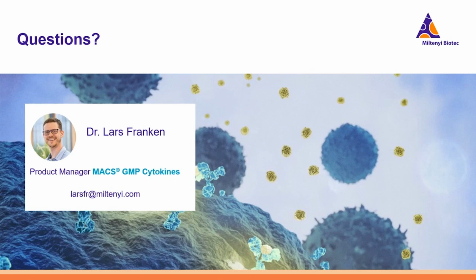Okay, so for that, two things would be really important. If you spend your time on side-by-side testing, first of all, you need to know roughly where you start. You remember this dose response curve: you have a lower plateau where not much is going on, and then a top plateau where, rather independent of the concentration you apply, the biological effect will not change much. If you're doing side-by-side tests, be very sure you're not in this top plateau, because then you will not be able to see any difference between the cytokines. Make sure you are in the linear range of your assay.